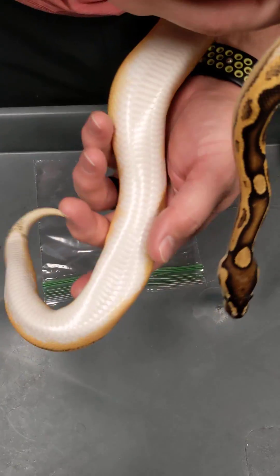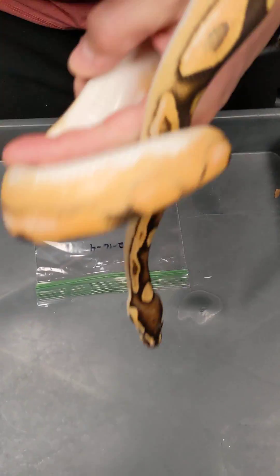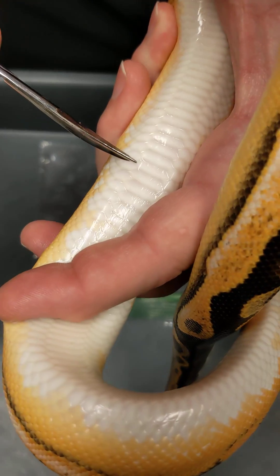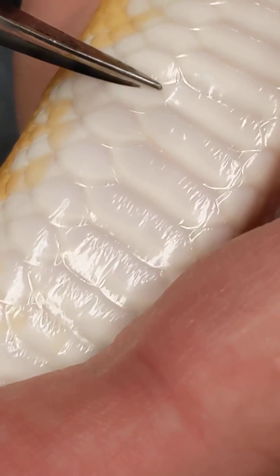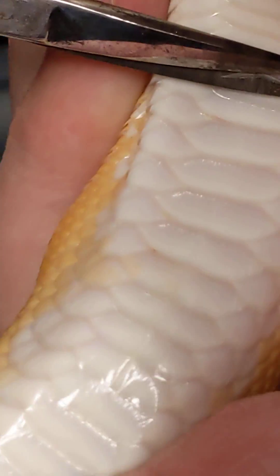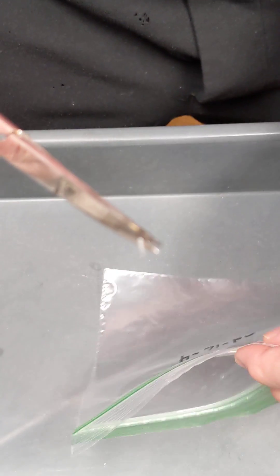We're going to show you real quick how to do a scale clip. This works really well on juvenile to adult sized ball pythons. You're going to come under one of these belly scales, and on the very edge it's clear. If you just get that clear part, it doesn't hurt the animal at all — it grows back after a shed or two.